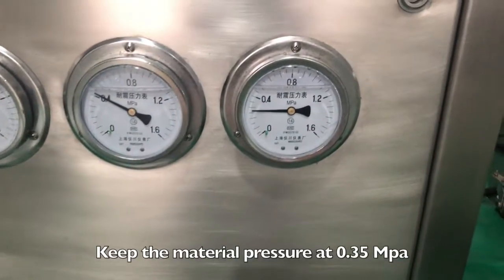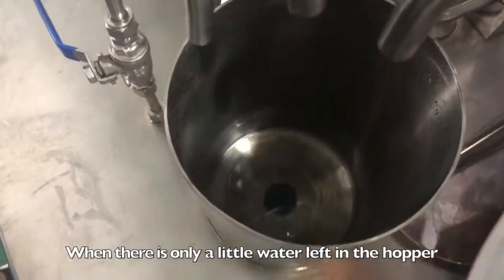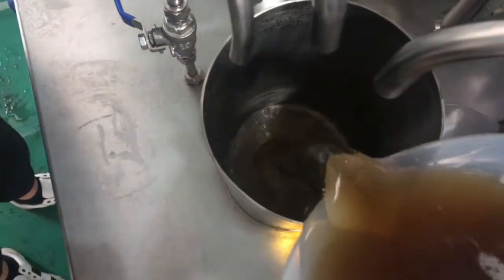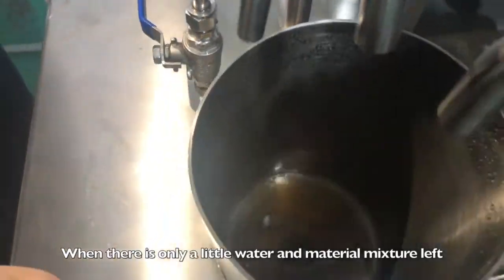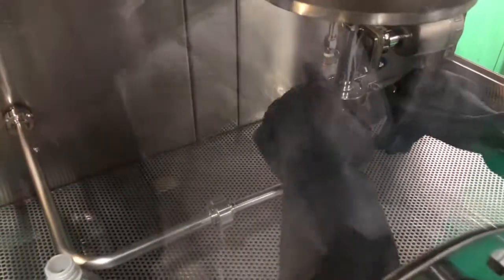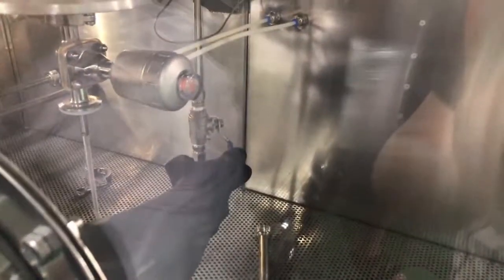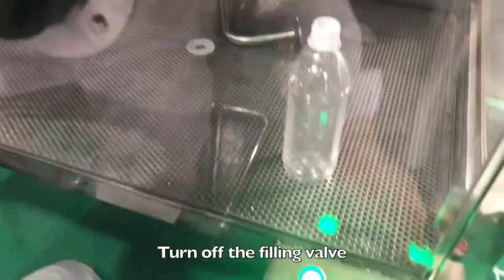Keep the material pressure at 0.35 MPa. When there is only a little water left in the hopper, add a little material. When there is only a little water and material mixture left, add all remaining material. Remove the return pipes and open the breathing valve. When the outlet starts to discharge material instead of water, turn off the filling valve.